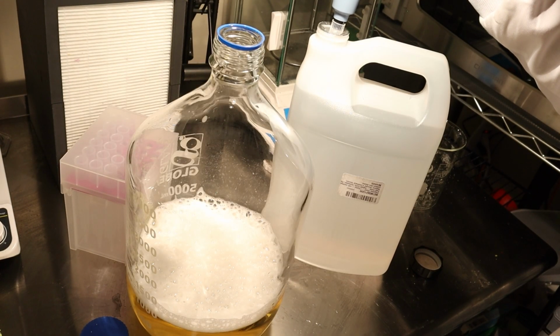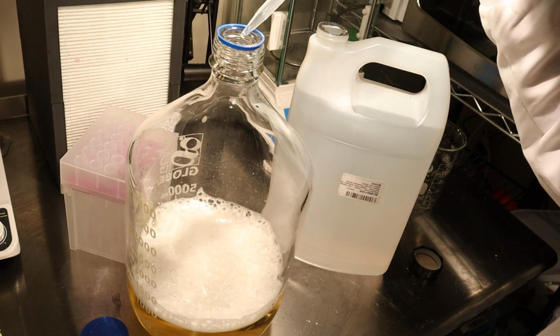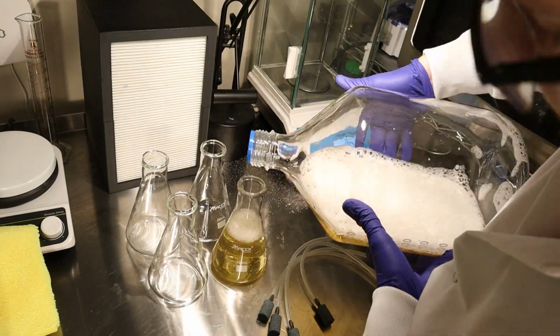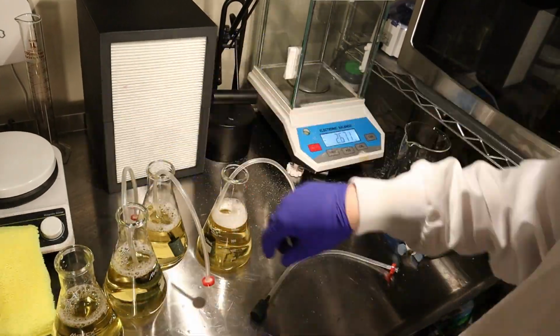To prepare for the airstone flask, I added 10 ml of propylene glycol to the remaining liter of media to act as an anti-foam agent so it doesn't bubble up like last time. Although this was actually 10 times the amount I was supposed to add, which luckily didn't affect the growth that much. I then mixed it up and transferred it to the flasks, added the airstone assemblies, and prepared everything for the autoclave.